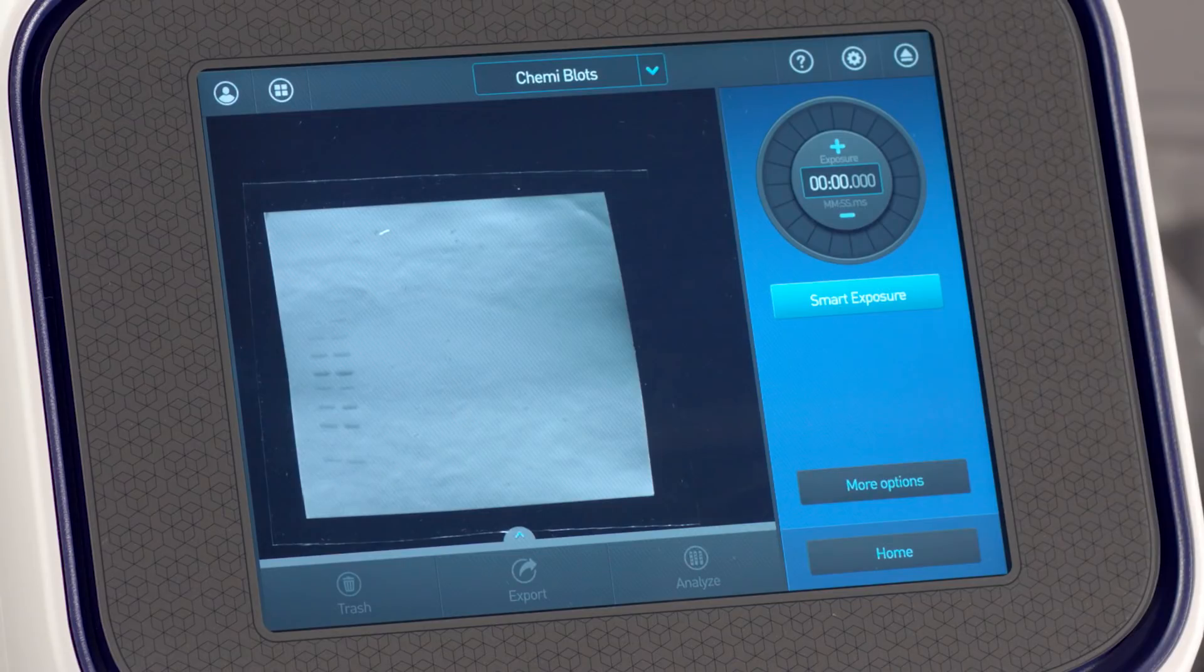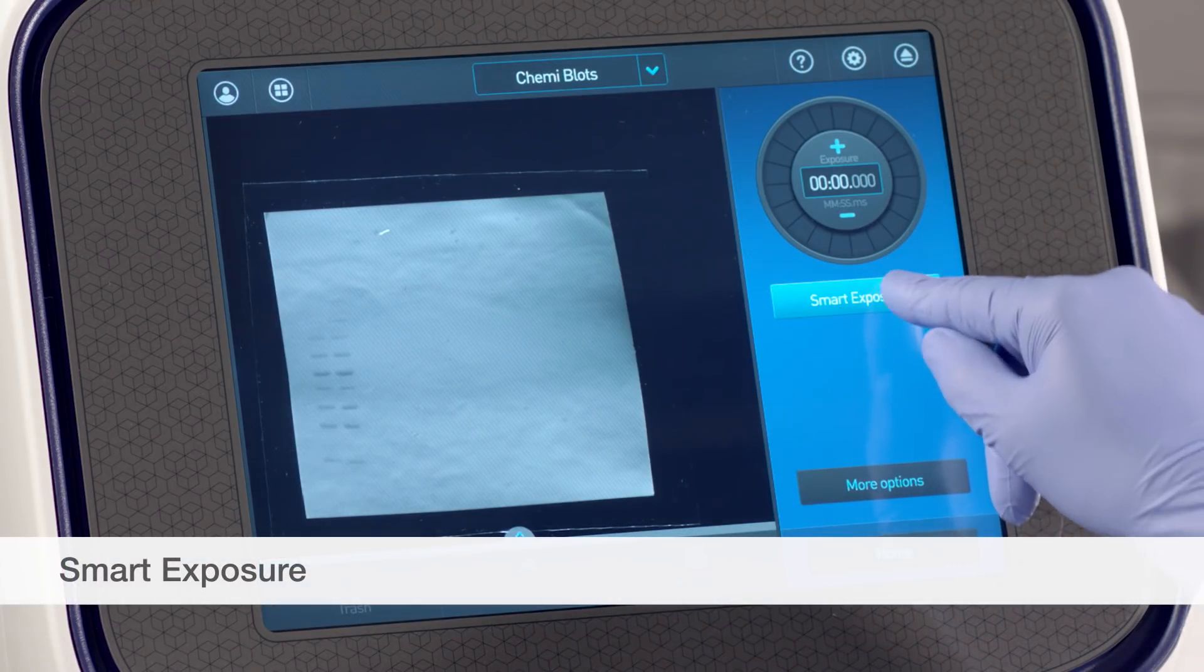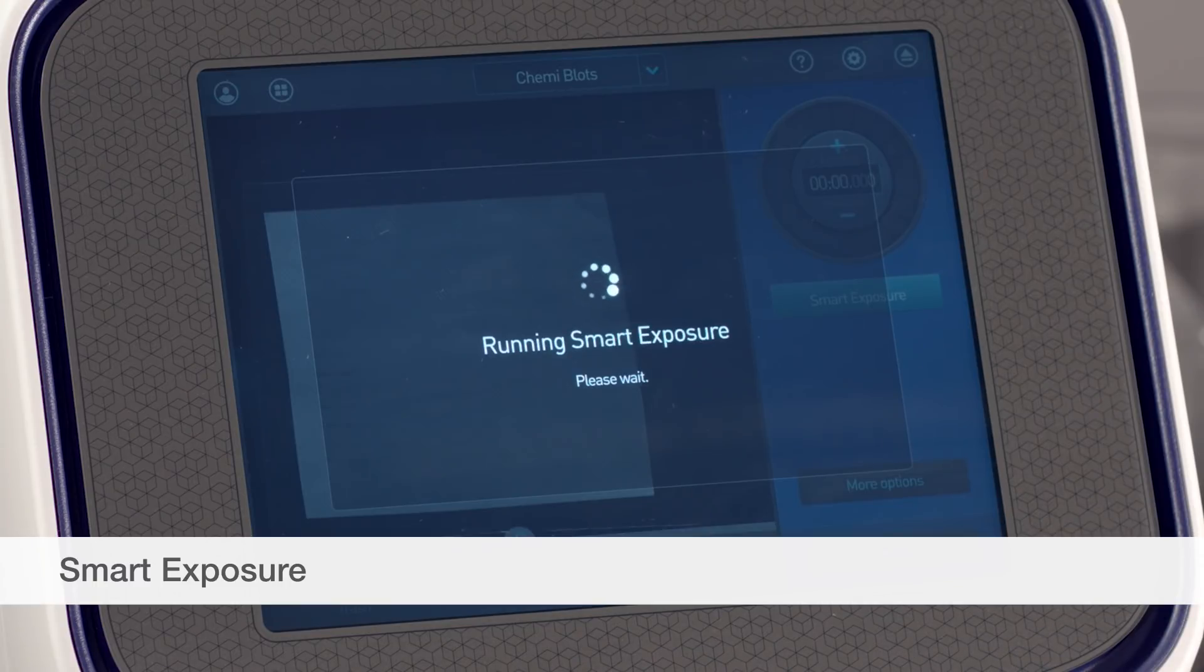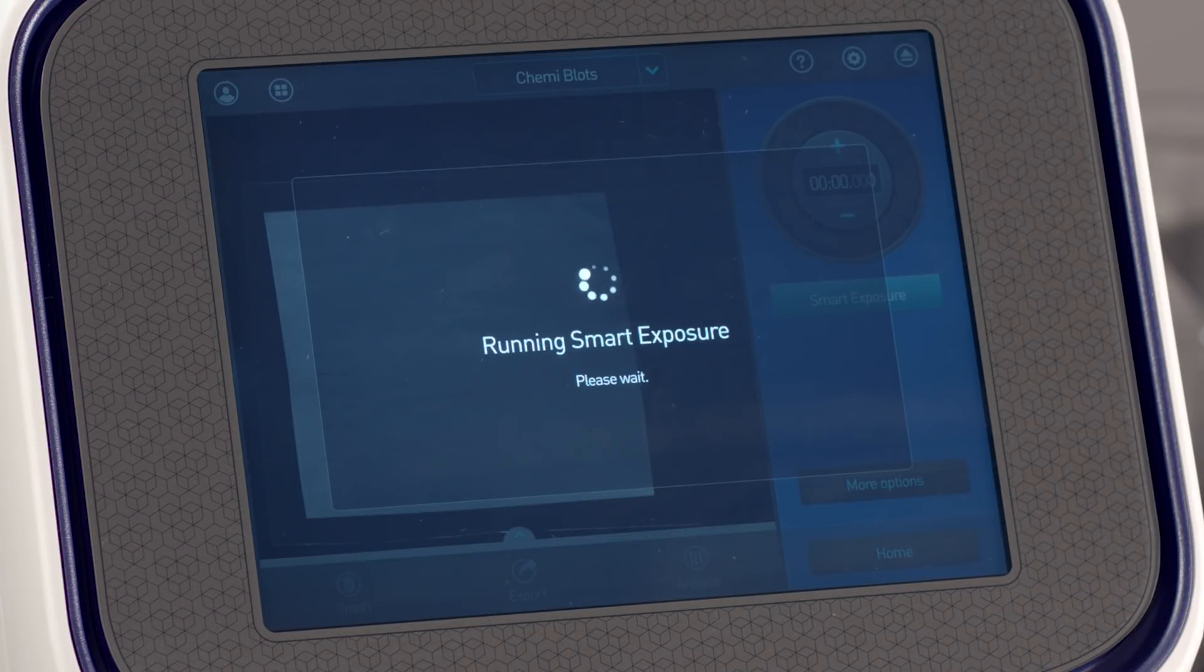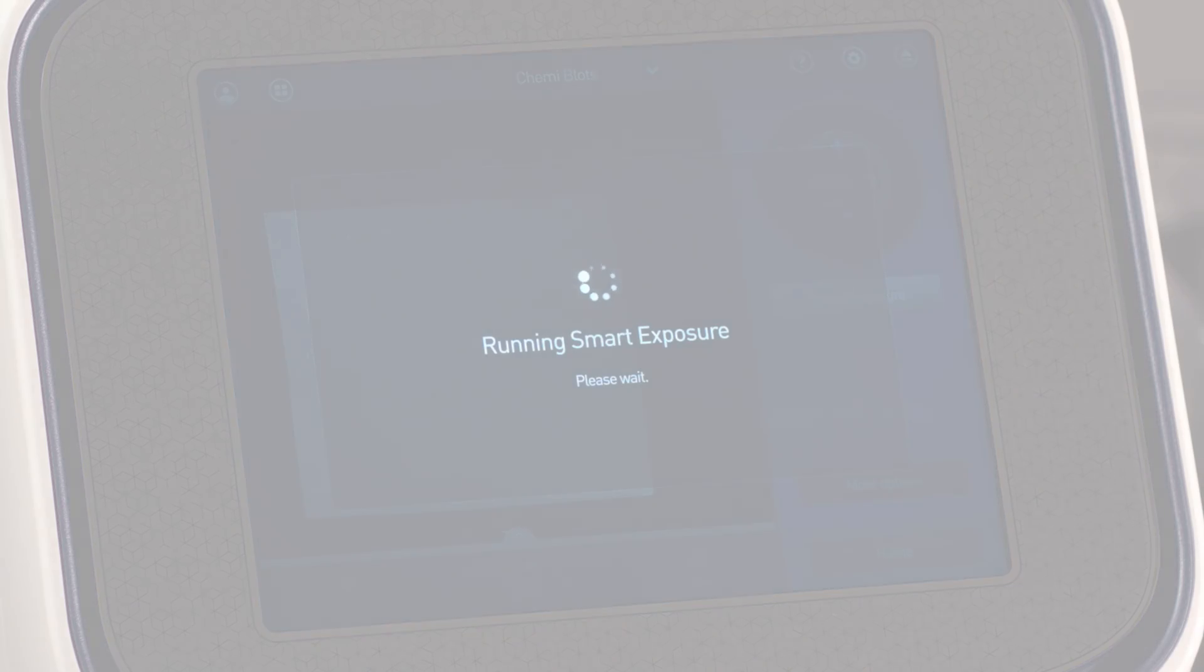For quick determination of the optimal exposure time, choose Smart Exposure. Smart Exposure automatically and rapidly determines the exposure time to minimize the need to repeat exposures to get the desired signal.